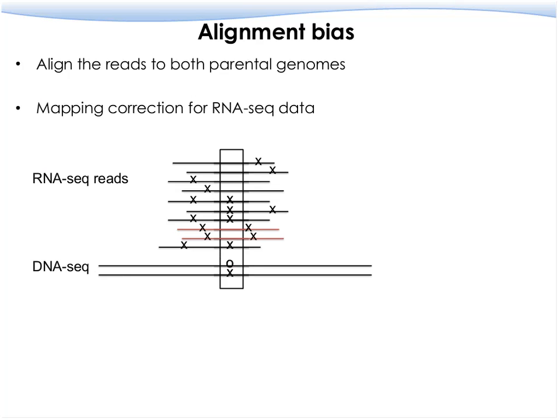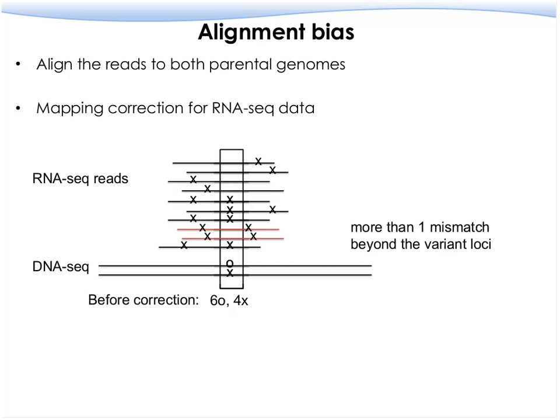If we focus on this particular location, when we do the sequence mapping, we allow, in this scenario, up to 2 mismatches for each individual sequencing read. Okay. However, if we don't do any consideration on this, we just count the number of reads that represent the reference or alternative, we may conclude that 6 reads support the reference and 4 support the alternative. And you may have the slight hint that this can be allele-specific expression. The expression levels of the 2 alleles can be different.